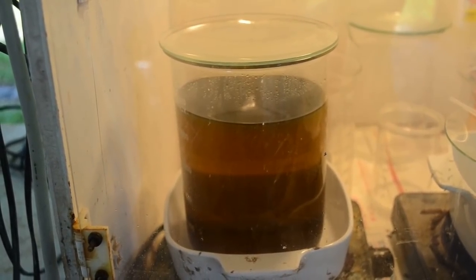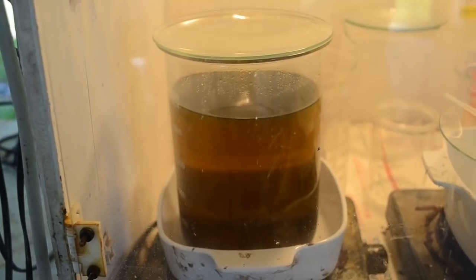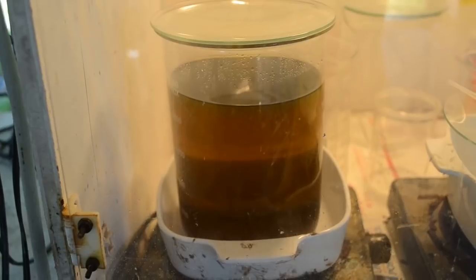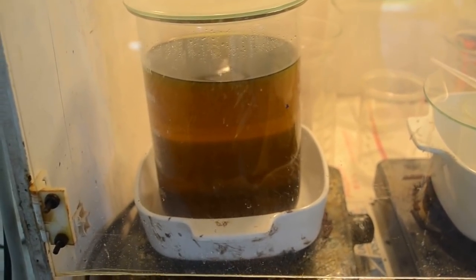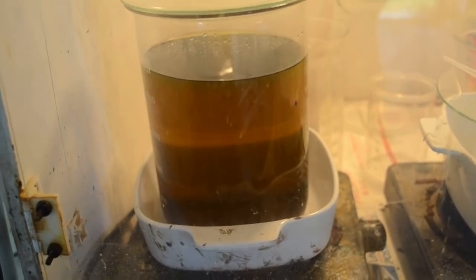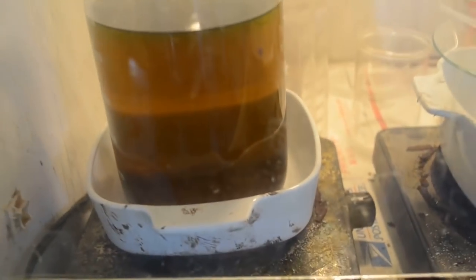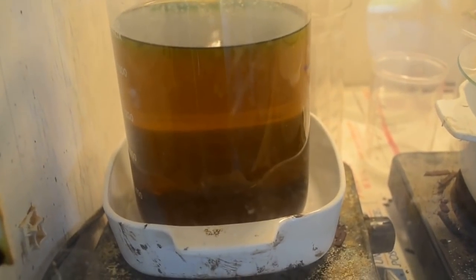The gold is really fine. It wasn't settling very well. I stirred this stuff vigorously a couple of times last night before going to bed just to see if I could break up whatever density stratifications were going on in there and get the gold to settle out. It is mostly settled. There's a good layer on the bottom of the beaker, which really isn't showing up here. But it's still cloudy, so there's still some fine stuff in there.